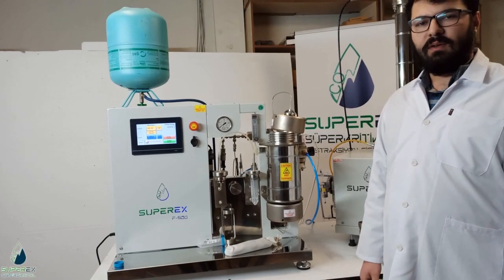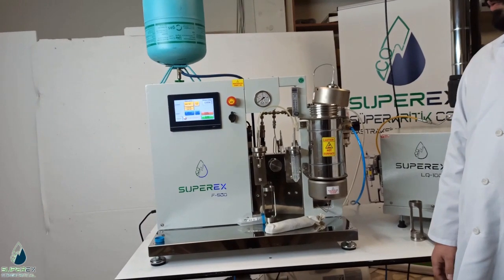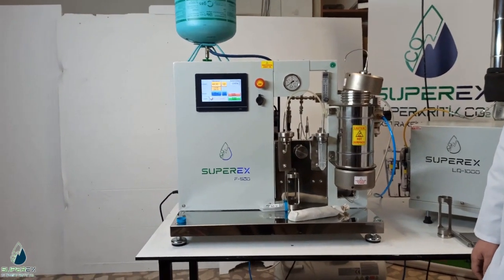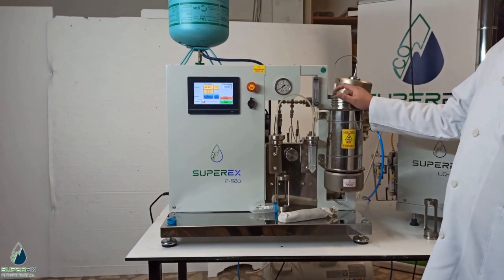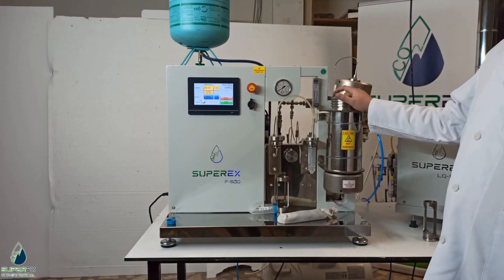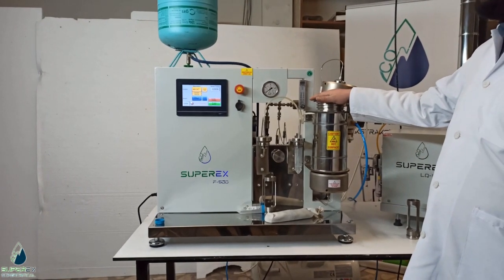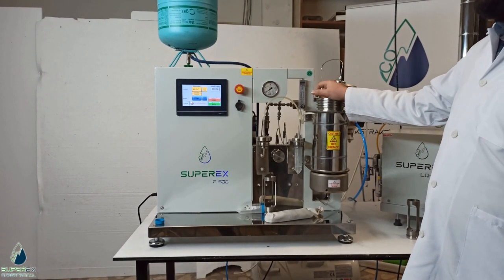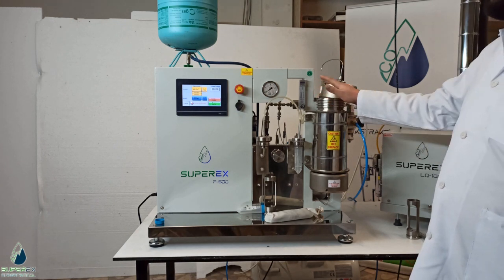Today we present our F500 supercritical CO2 extraction machine. This machine normally uses CO2 as a supercritical fluid as a solvent, but today we will use a different fluid called R134a, which is actually a cooling plant refrigerant.